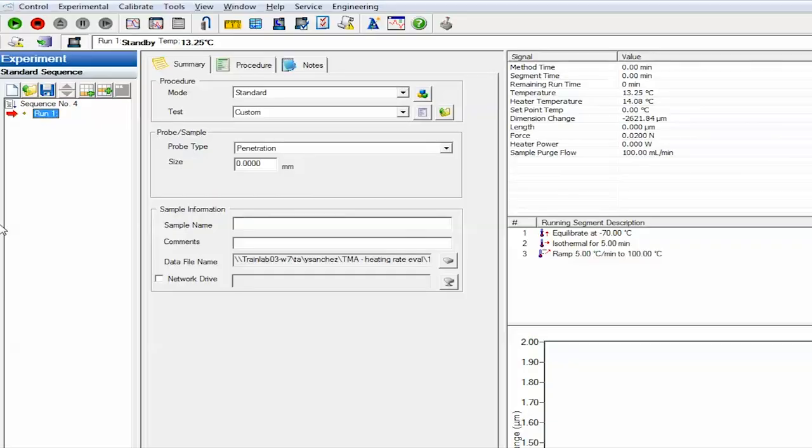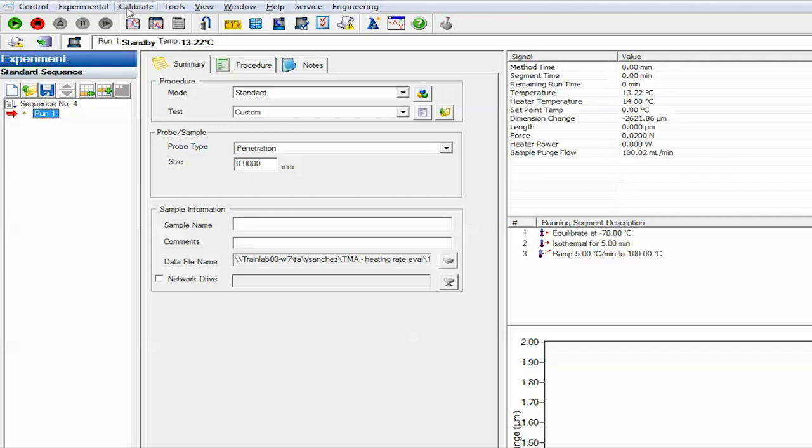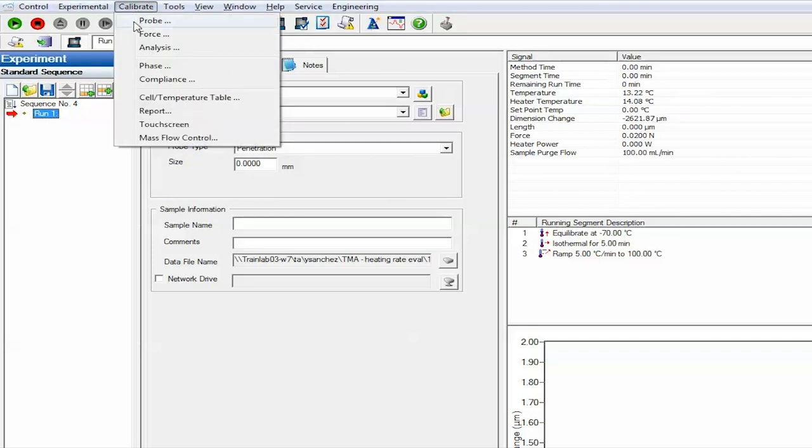Remember you need to calibrate the probe since you switched probes. You do so by selecting calibrate, probe, verify the probe type, and click calibrate.